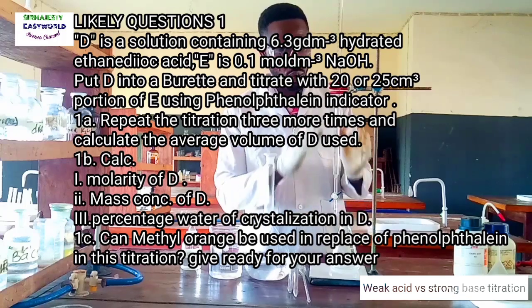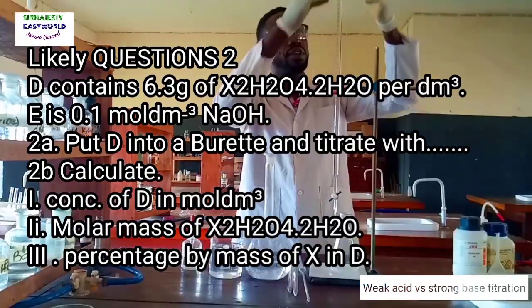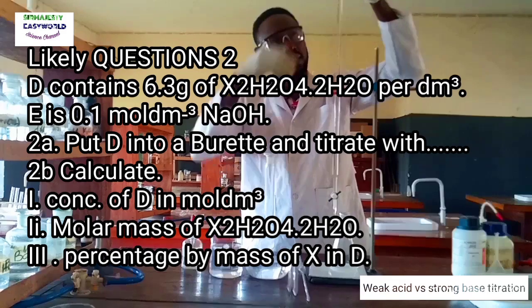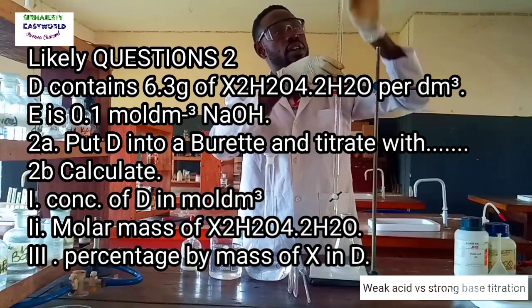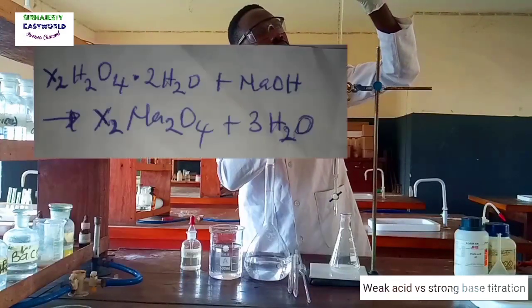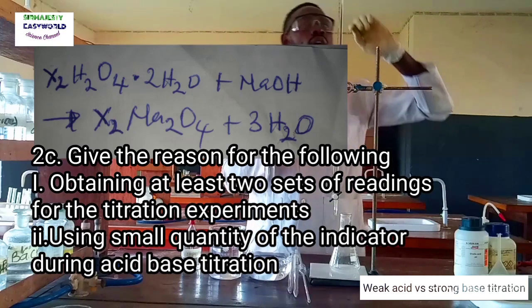Here are the materials required — I've set up everything. I've filled the burette already with A, that's the oxalic acid. The initial burette reading is 0.00.